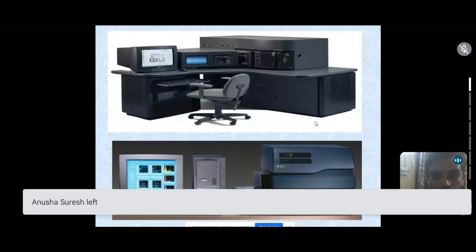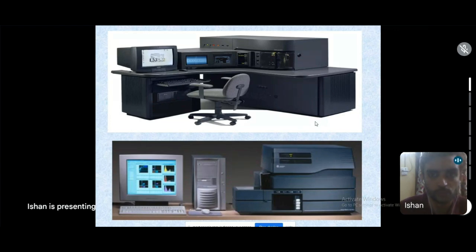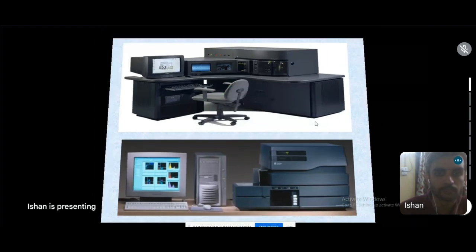This is just a general view of the advanced setup of a flow cytometer. It can be a benchtop flow cytometer, or a full-length flow cytometer. There are different companies making flow cytometers of different kinds. In the early stages of development, two decades ago, a flow cytometer could capture a whole room for a setup.